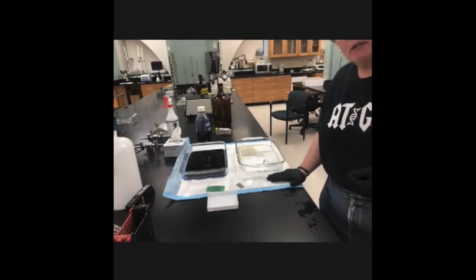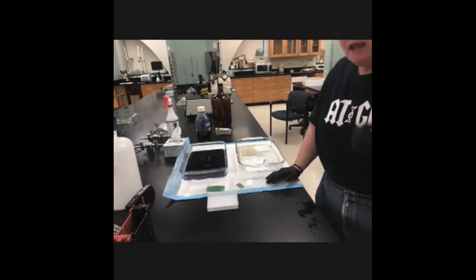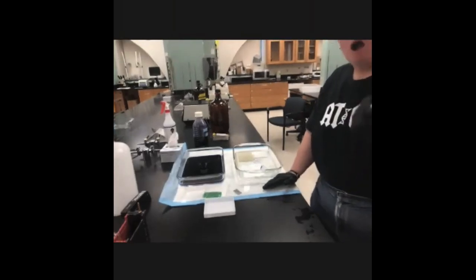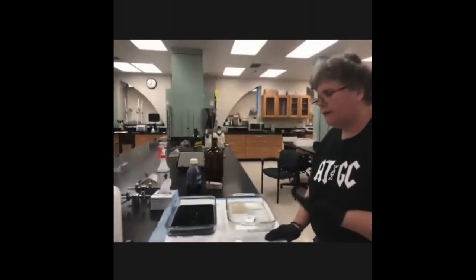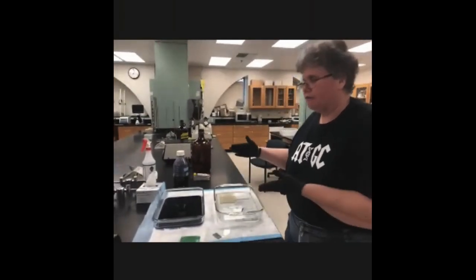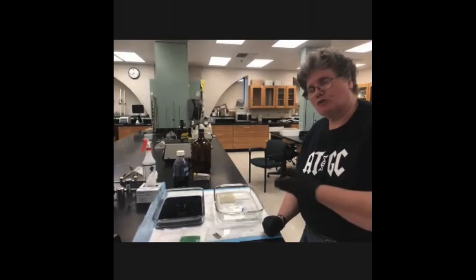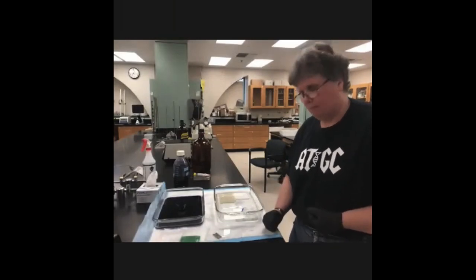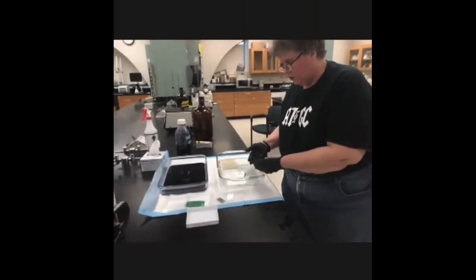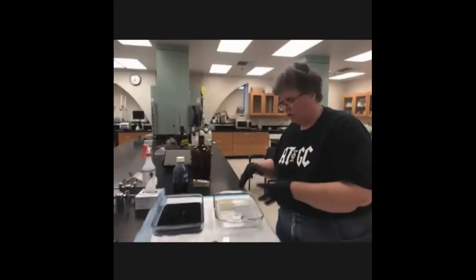What's happening while it's soaking in the transfer buffer? Our gel contains SDS, and SDS can inhibit the ability of the proteins to transfer to our PVDF membrane. On the other hand, our transfer buffer does not have SDS in it, and it does have methanol in it. Methanol can enhance the ability of the proteins to transfer to the PVDF membrane. So we're soaking it for approximately 40 minutes to allow all the SDS to come out and to allow the transfer buffer to go into the gel.